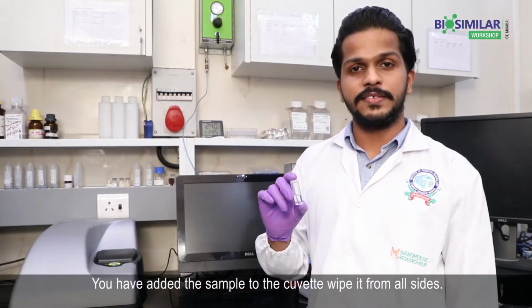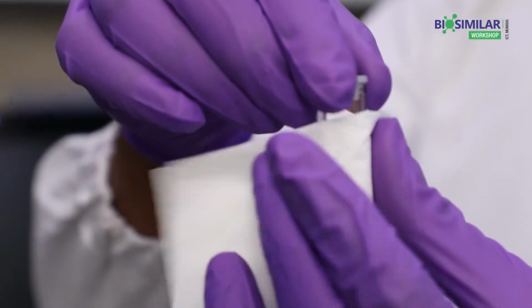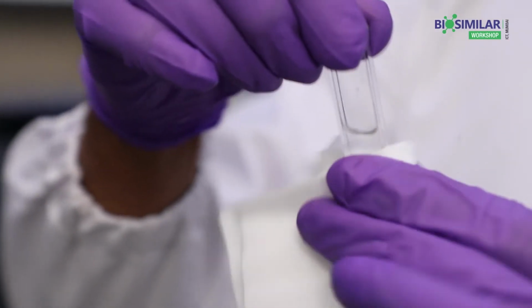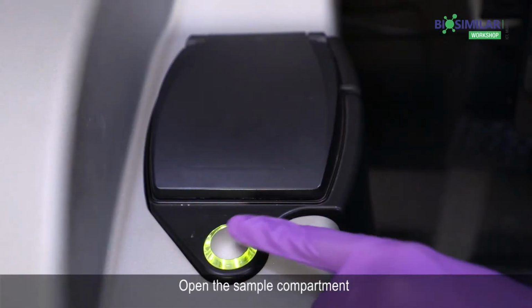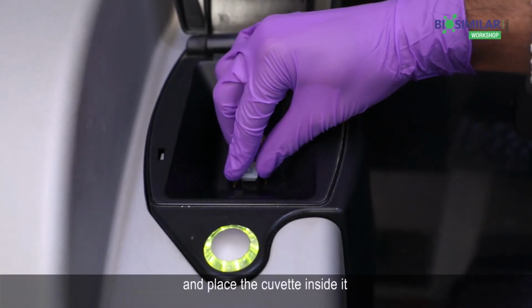After you have added the sample to the cuvette, wipe it from all sides. Then open the sample compartment and place the cuvette inside it.